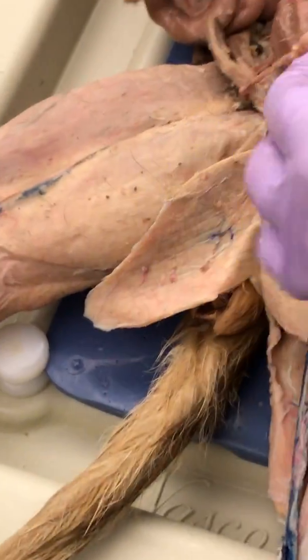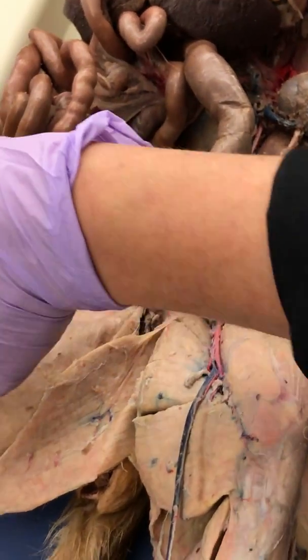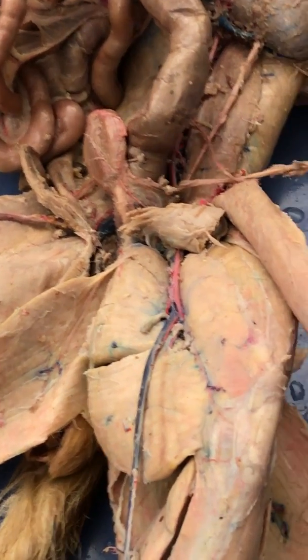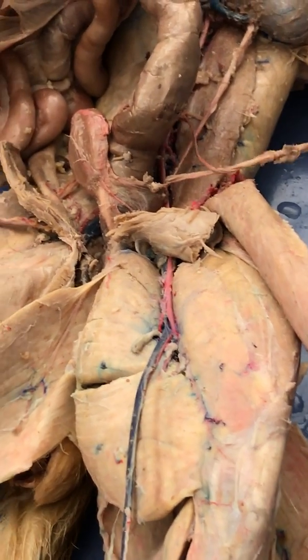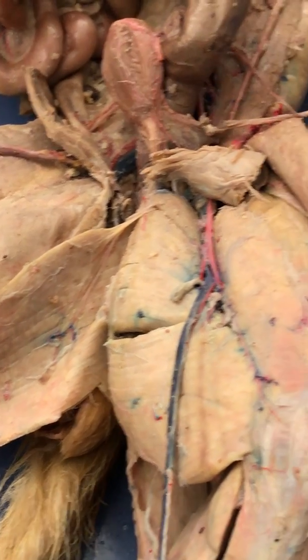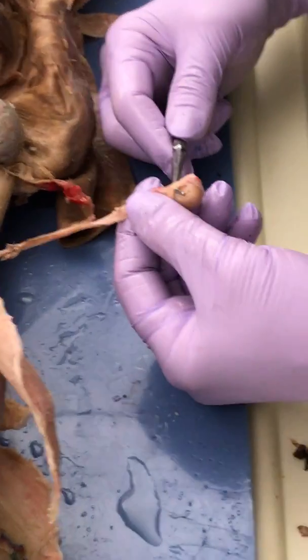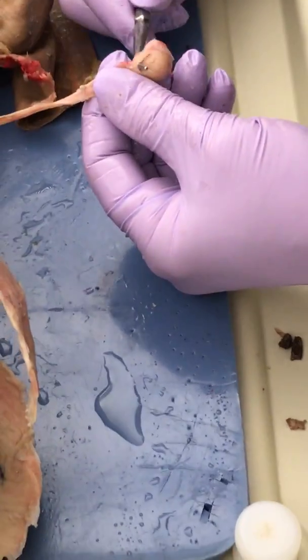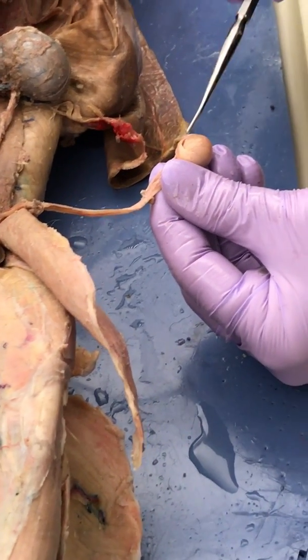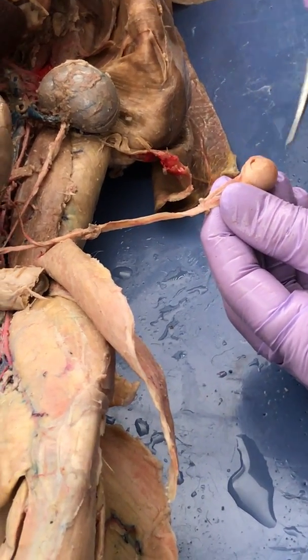Now this one still has a covering on it. This one doesn't. What's the name of the covering? I don't remember this. No, I have it somewhere. Tunica albuginea. Are you filming me playing with this testis? Sure. So I just want to make sure you guys can see it's two separate things. That's why I put my probe all the way through. So this is the testis, and then there's the epididymis.